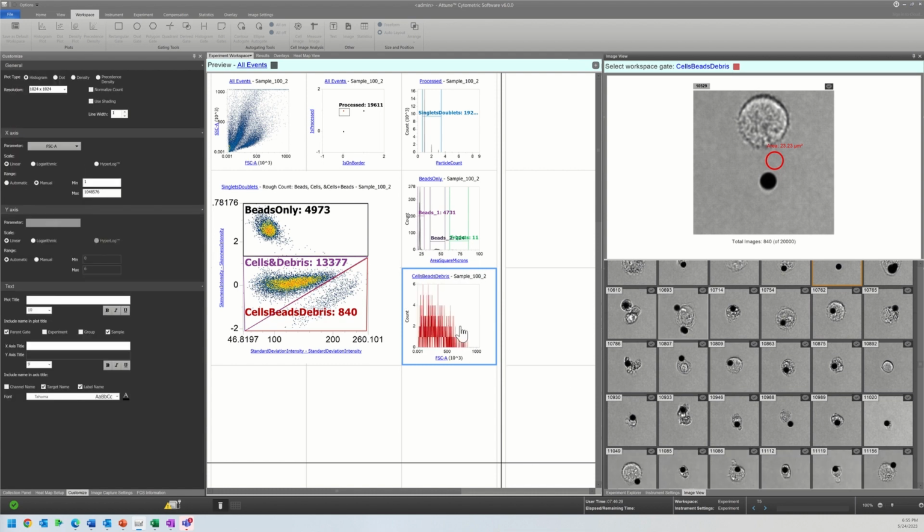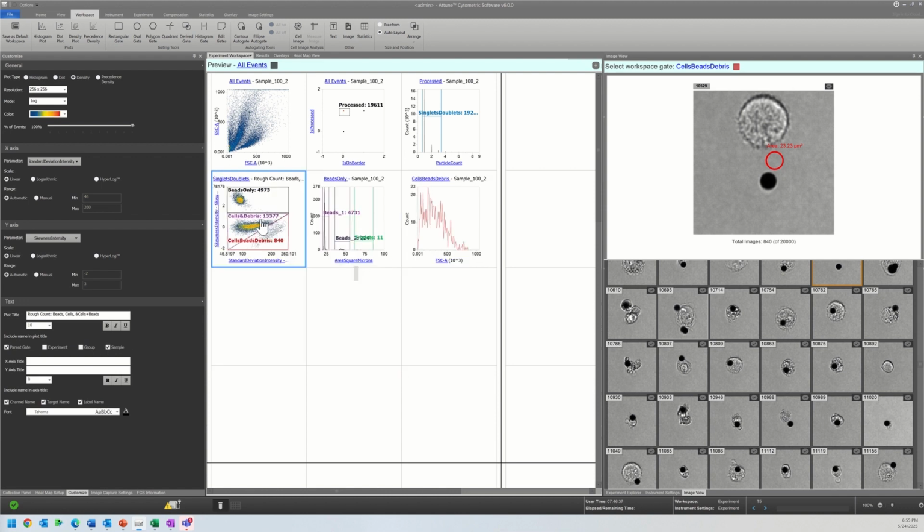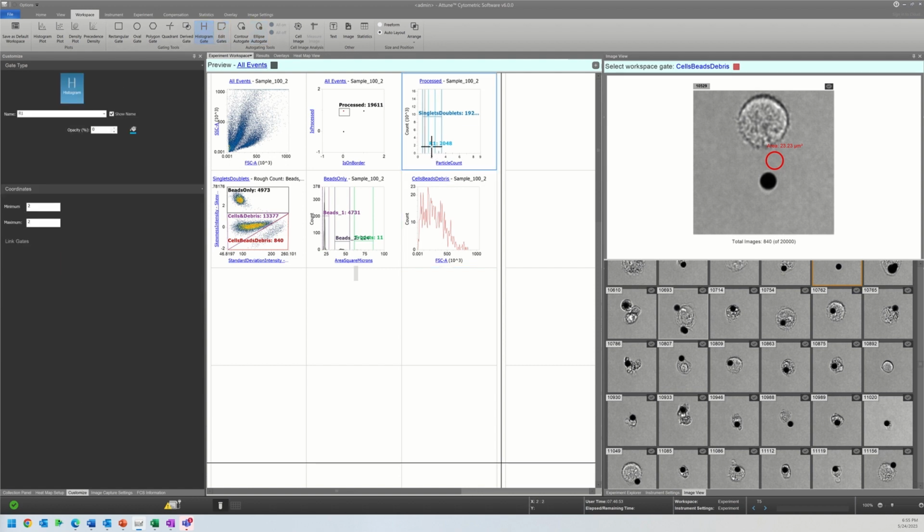This is a very small population. So we're going to really reduce the resolution on my histogram. And there are a few different ways that I can go about doing this. One of the things I'm going to do here is use my particle count feature.